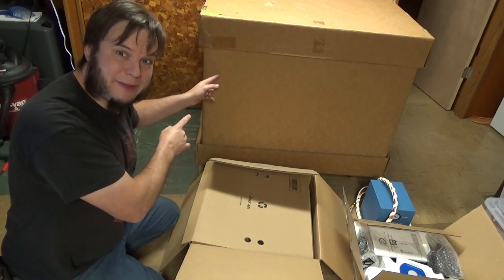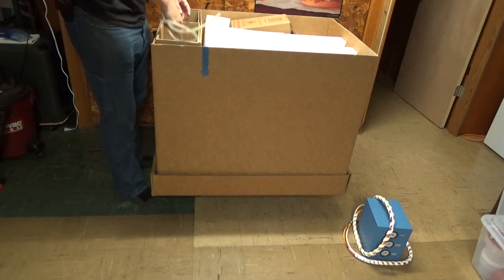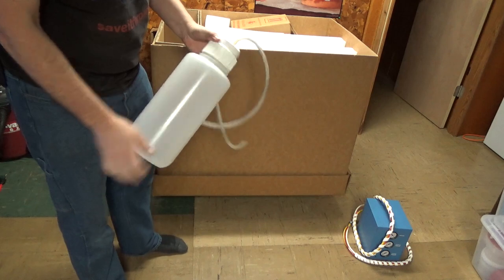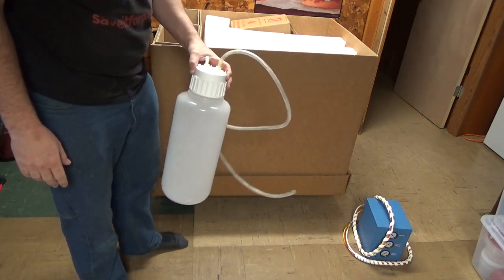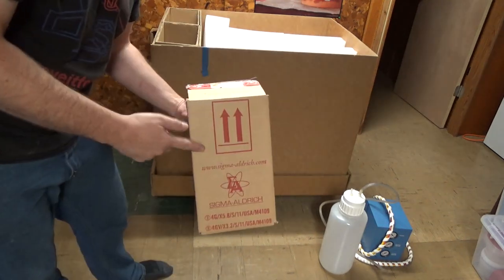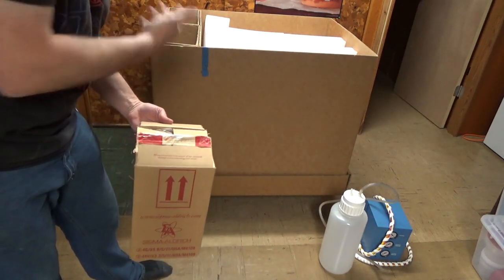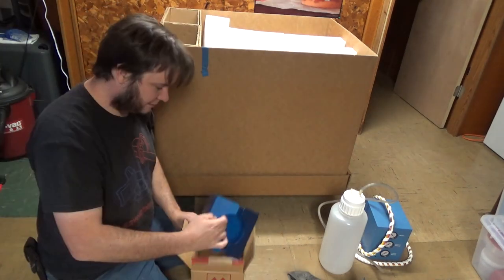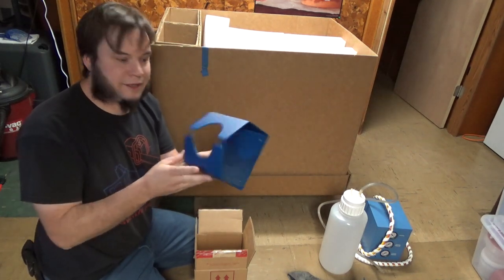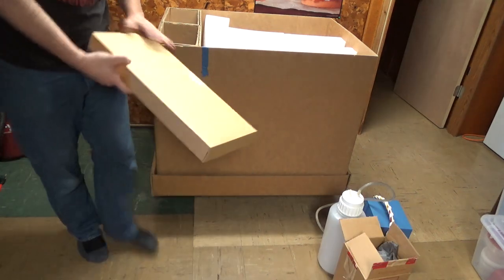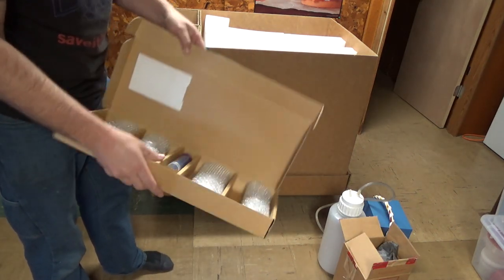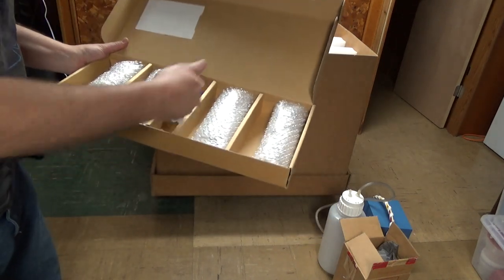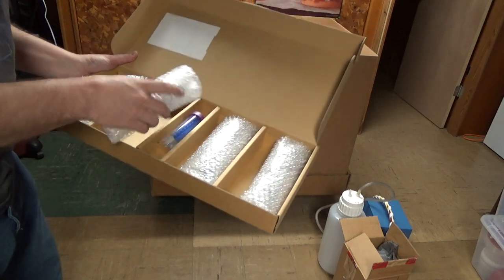Alright, we have a giant mystery Nalgene bottle. Give water to a gigantic hamster with that. Got a mysterious box here. It says this side up, it was definitely stored sideways in there, so let's see if anything fun spilled. This seems to be mostly packing material and a blue thing that is definitely a thing. We've got another keyboard maybe? Oh no, this is actually some kind of science junk.